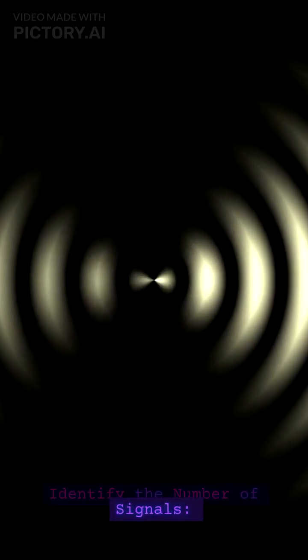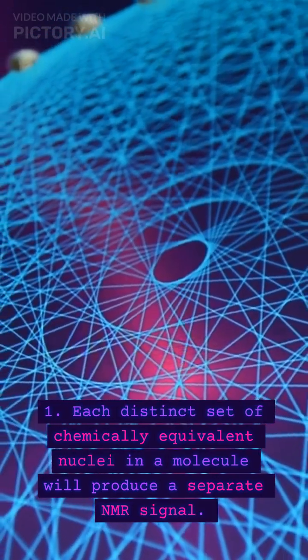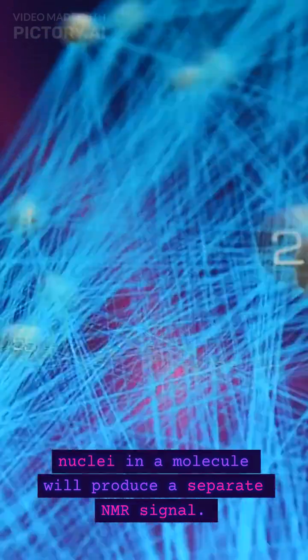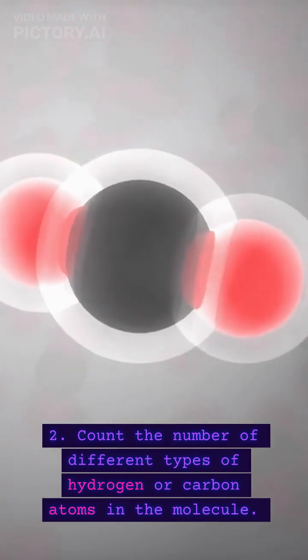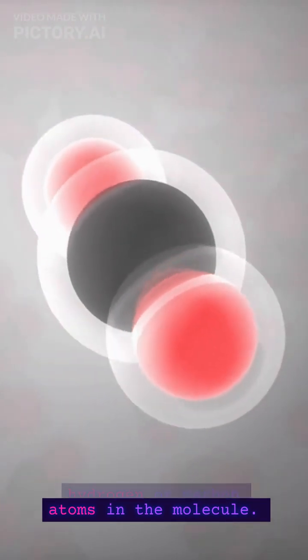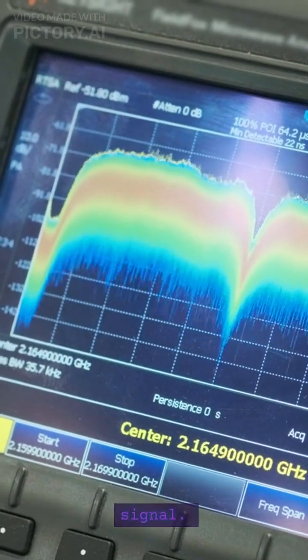Identify the number of signals. 1. Each distinct set of chemically equivalent nuclei in a molecule will produce a separate NMR signal. 2. Count the number of different types of hydrogen or carbon atoms in the molecule. Each type corresponds to a unique signal.